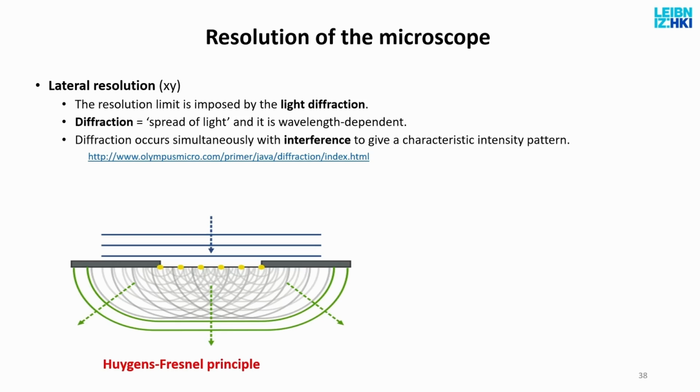Okay. Why is that? It is because when light arrives at a very small obstacle, molecules, etc., it will not continue straight, but rather suffers what's called diffraction. That is, a parallel beam comes in and hits a very small object or a very small gap in a tissue. This very small object will behave as a source of spherical waves.